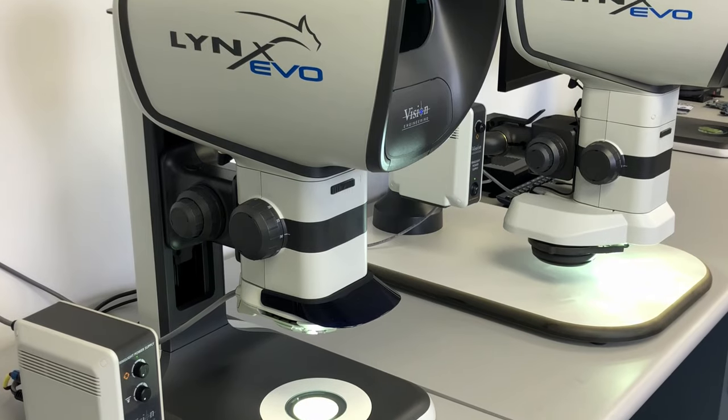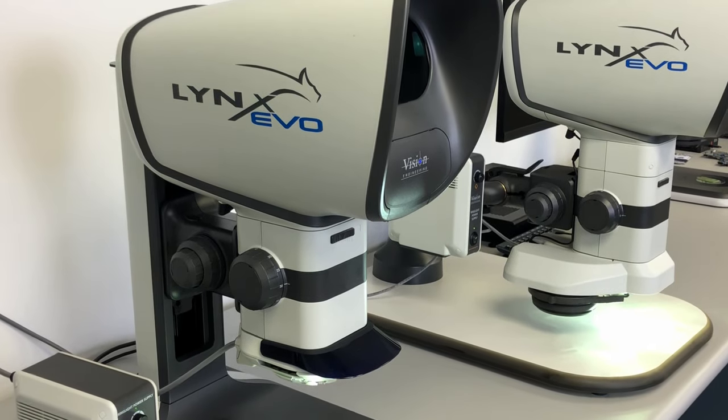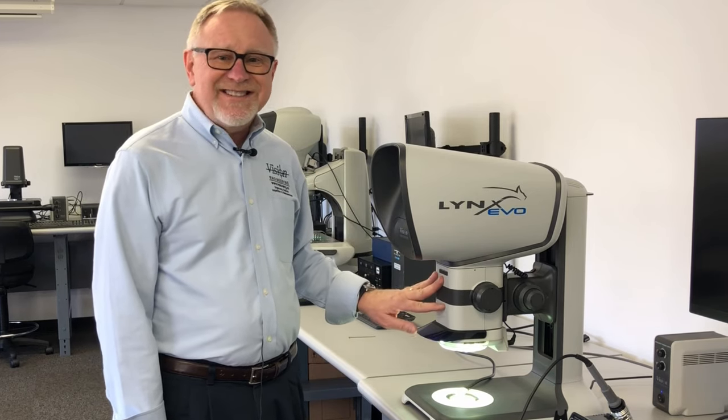The Lynx Evo is Vision's generation 6 of our projected image Dynascope, giving you full stereo imaging without the need for eyepieces. This system features a 10 to 1 zoom, yielding 6 to 60 times magnification with a 1x objective.